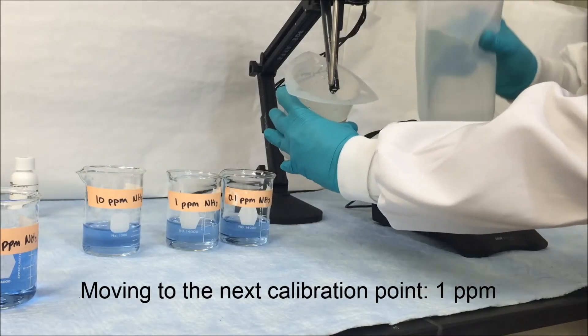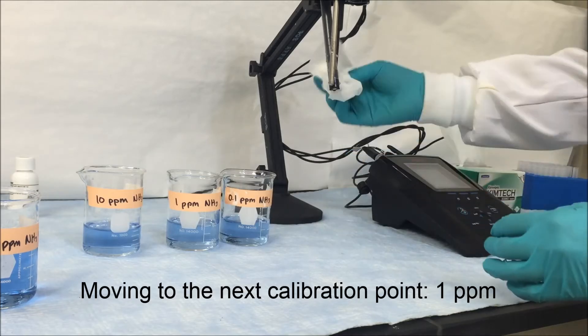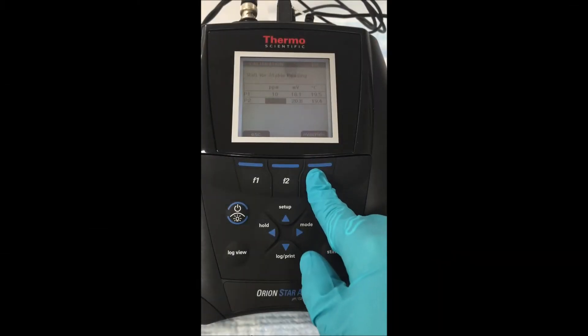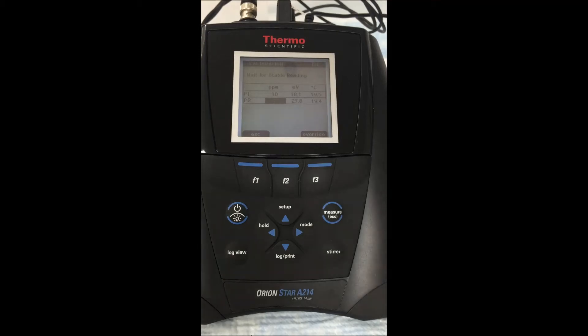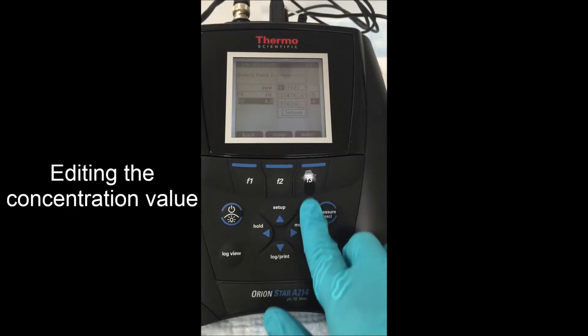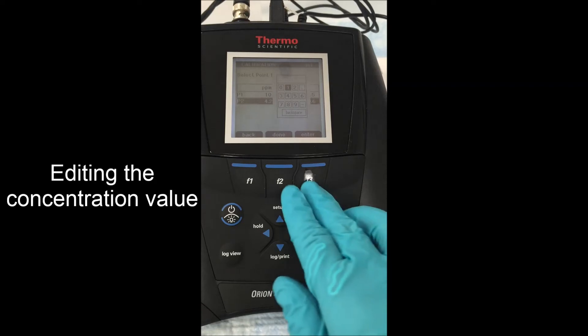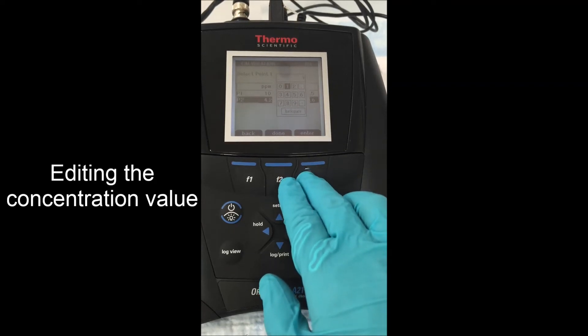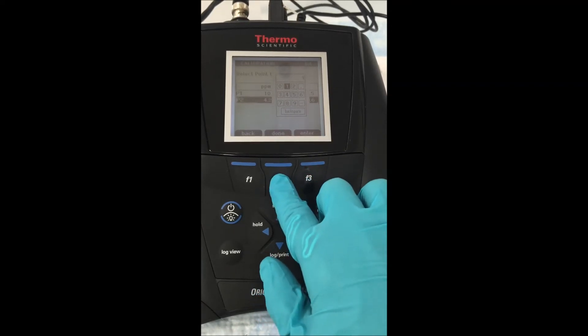We're going to then take the electrode out of the 10, rinse it thoroughly and put it into our 1 mid-level part per million solution. Hitting start again on the meter, we're going to wait until the meter register is ready. Once the meter register is ready, we're going to edit the concentration value to 1 part per million. Hitting accept and starting on to the next point.